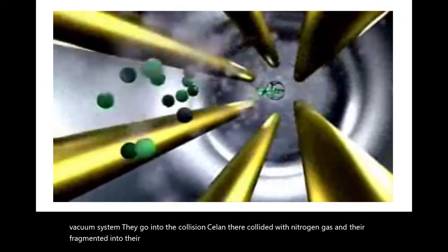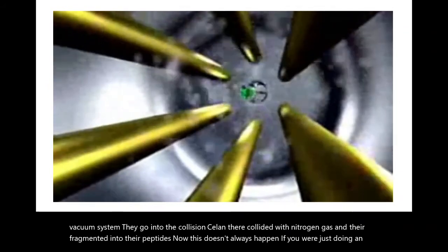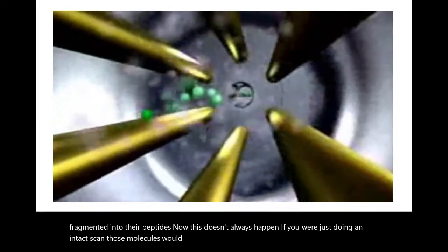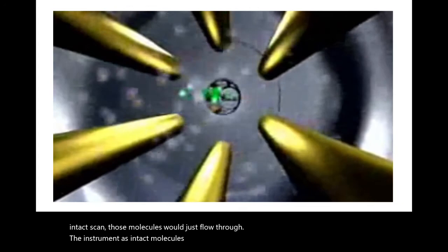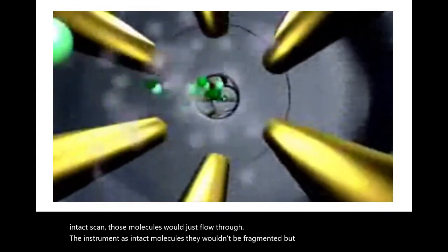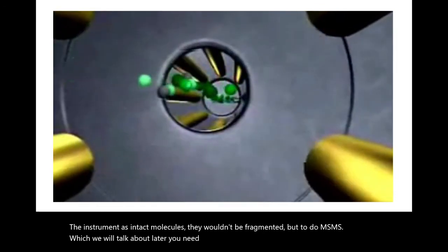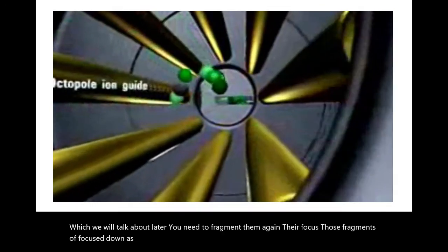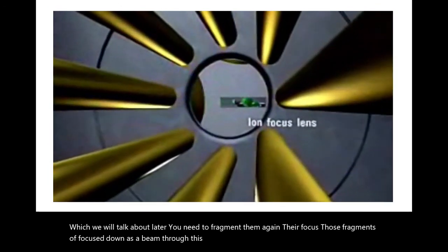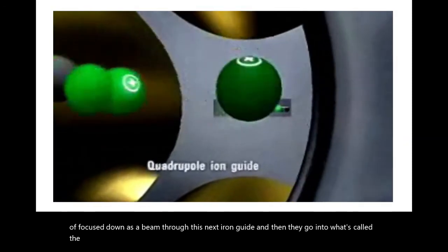Now, this doesn't always happen. If you were just doing an intact scan, those molecules would just flow through the instrument as intact molecules. They wouldn't be fragmented. But to do MSMS, which we will talk about later, you need to fragment them. Again, those fragments are focused down as a beam through this next ion guide, and then they go into what's called the pusher inside the time of flight tube.